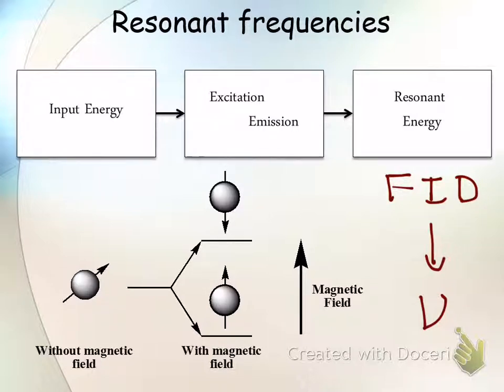And so we dissolve our product in that, and it goes into the instrument. This tells us how deep it goes. One of the things that's really difficult about magnetic fields is to have them be really consistent. So one of the things we do to help maintain consistency, or homogenize the magnetic field on the sample, is we just spin it at a very high rate.